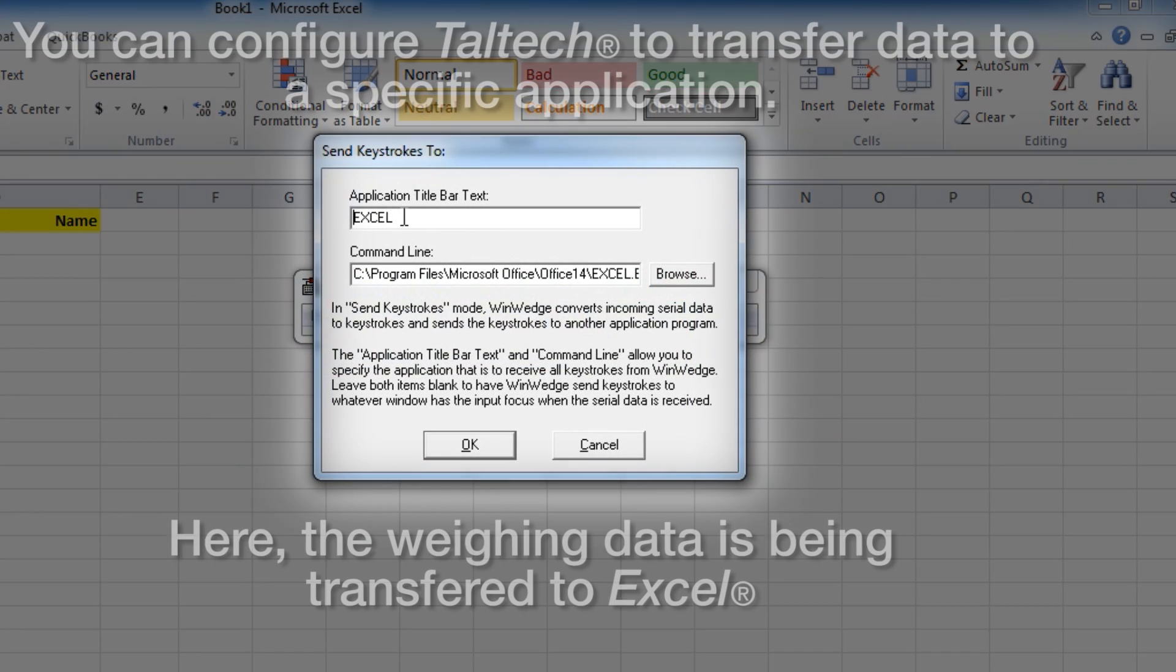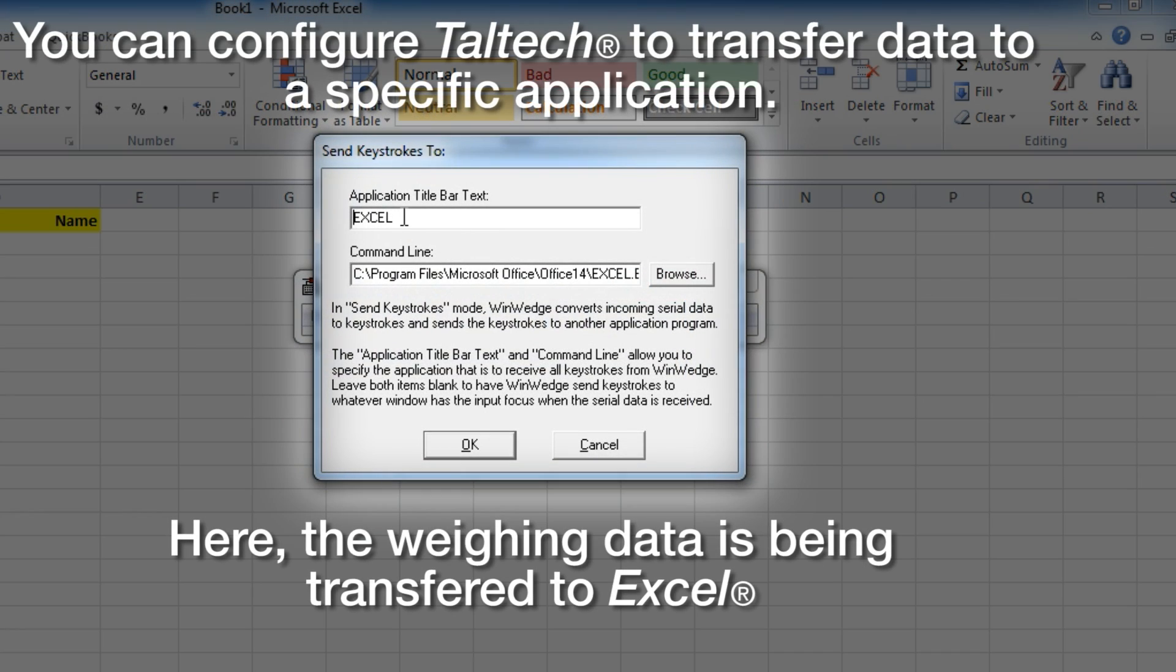Depending on the software you have chosen, you may configure your software to best match your application.